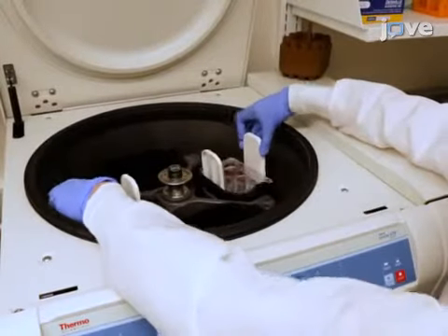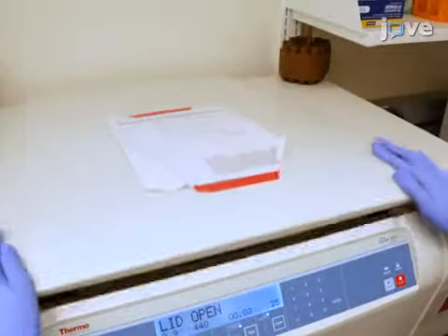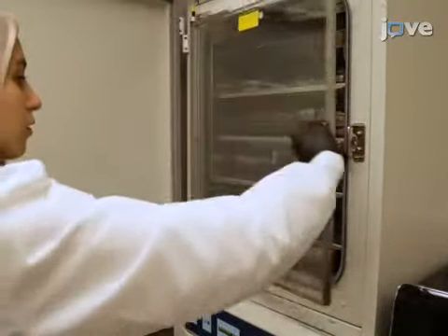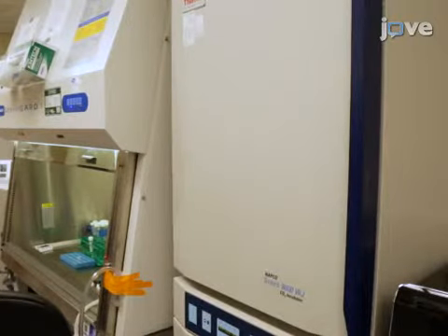Centrifuge the plate at 440 G for 120 minutes at 37 degrees Celsius. After centrifugation, transfer the plate to an incubator for overnight incubation at 37 degrees Celsius with 5% carbon dioxide.